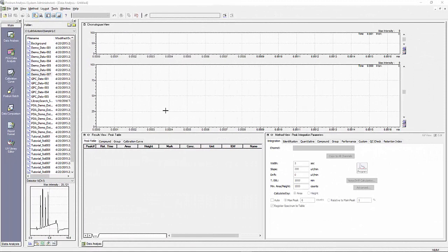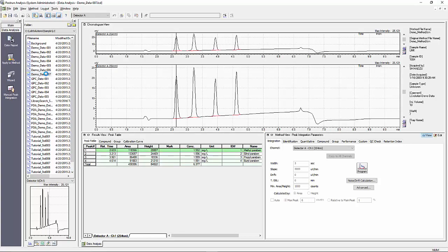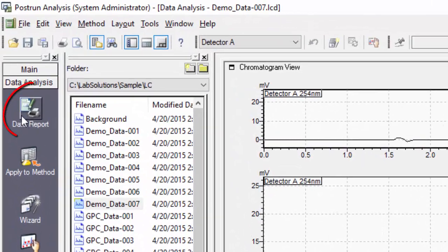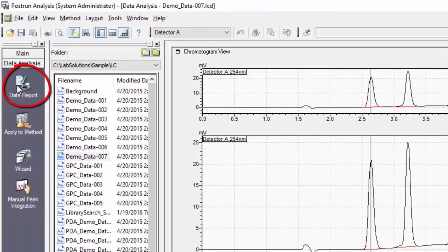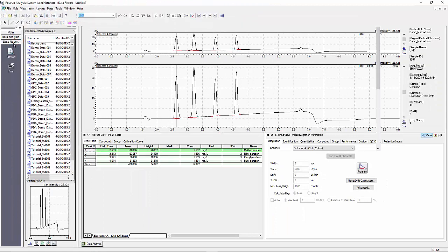To begin, within post run select data analysis. Once you have opened a data file within post run you will see a data report option in the top of the assistant bar on the left-hand side. To view or edit a report on the currently open data file, click on the data report icon.